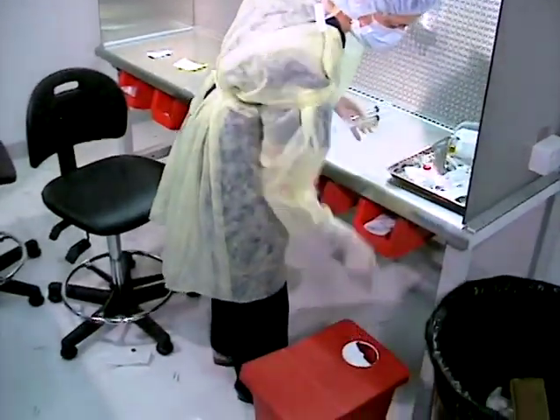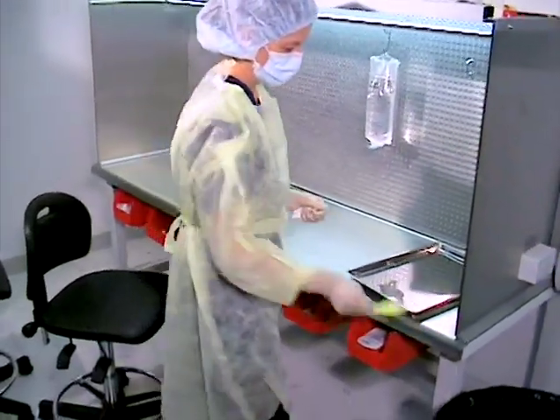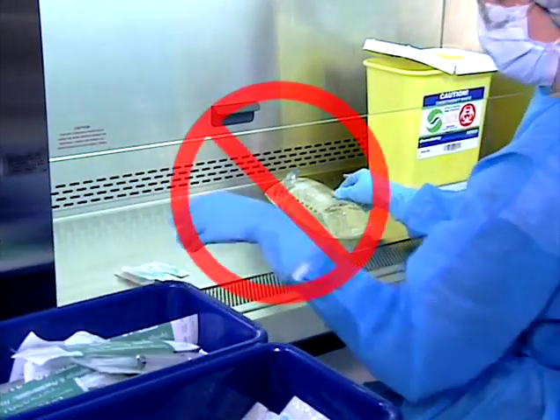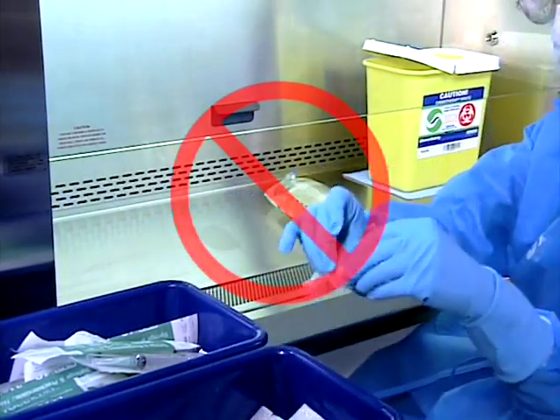Any unused drugs, components, and labels should be removed from the compounding area. Unused components remaining in a BSC where hazardous materials have been compounded must be assumed to be contaminated and cannot be returned to general storage areas.